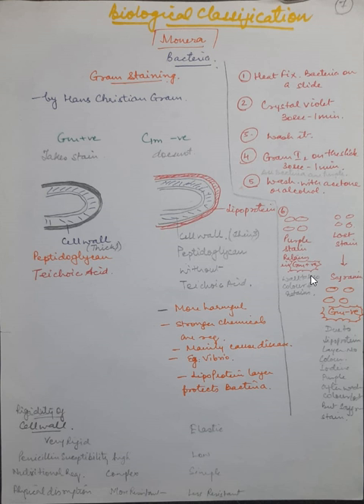Because of the cell wall present in it, it takes the color and helps in retaining the color, whereas at the same time some bacteria lose the color. Before washing it was there, but once it is washed with acetone or alcohol, they lose the color. Then we add safranin, another kind of stain, and this will also give color, but gram negative bacteria take the color that comes from safranin, and they do not take the color that was added by crystal violet.